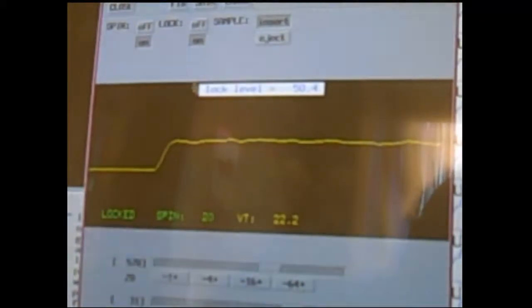At this point you're ready to close this window and prepare to run your sample. To begin running your sample, you'll type in ALOK equals NO, and these are all written on the job aid sheet. That autolock equals N turns off the autolock feature, and then WSHIM equals N turns off the autoshim feature. That will cut off about three to four minutes off of each run. The next command GA actually starts your run. It means go and acquire. As soon as you start that, your sample begins to be analyzed.